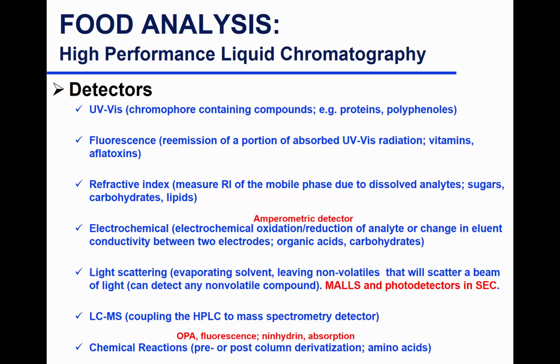When your sample is ionized, you can get molecular mass, or what we call the m/z value. Depending on the charge that it carries, you get mass by charge value from the detector. It's a very good tool for identification, and we gave examples in the LC lab, and you'll have more examples and explanation when you run the MS lab.